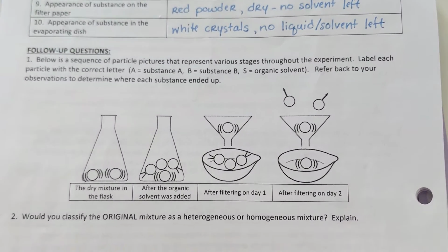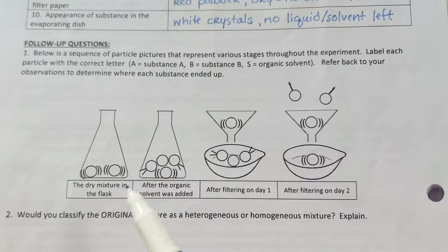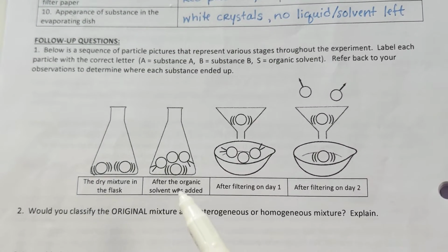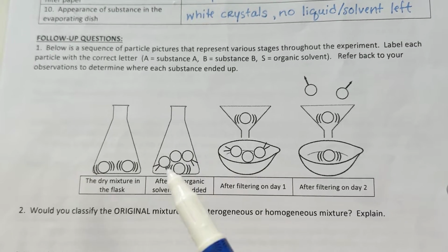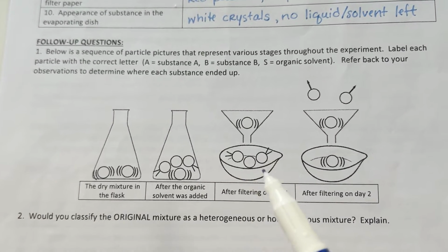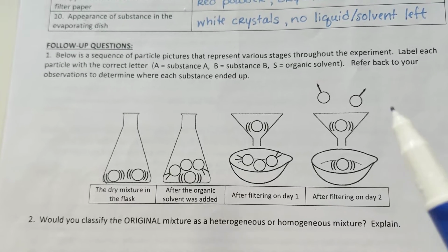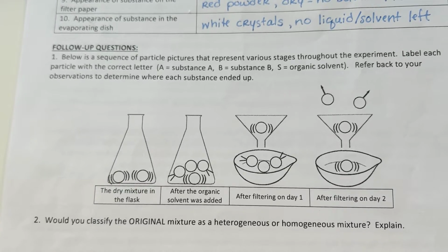All right, so in question 1, you are asked to look at these 4 pictures. So we're starting here. This is the dry mixture in the flask. Then we have the organic solvent added to the flask. We have what we saw on day 1 after we filtered. So this is what you put into the fume hood, basically. And this is what you saw on day 2 after it had been sitting overnight for 1 night.